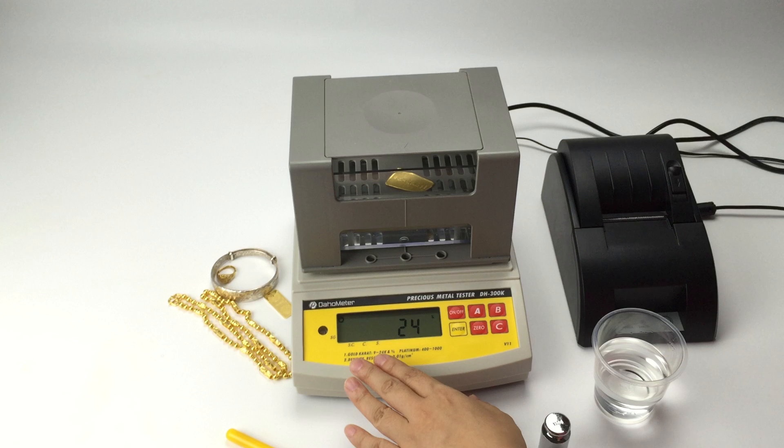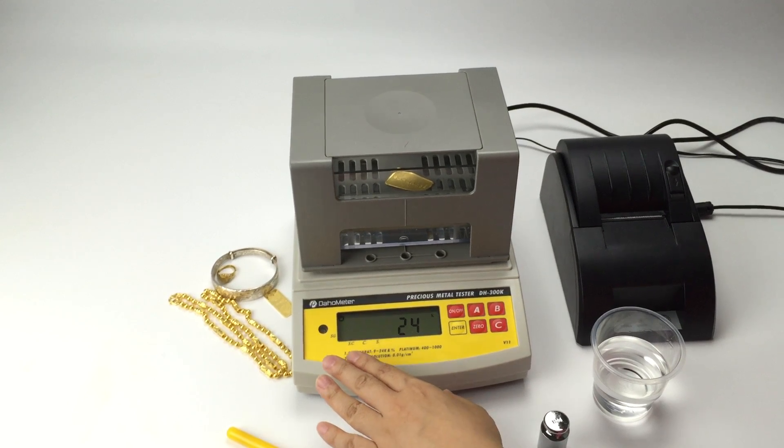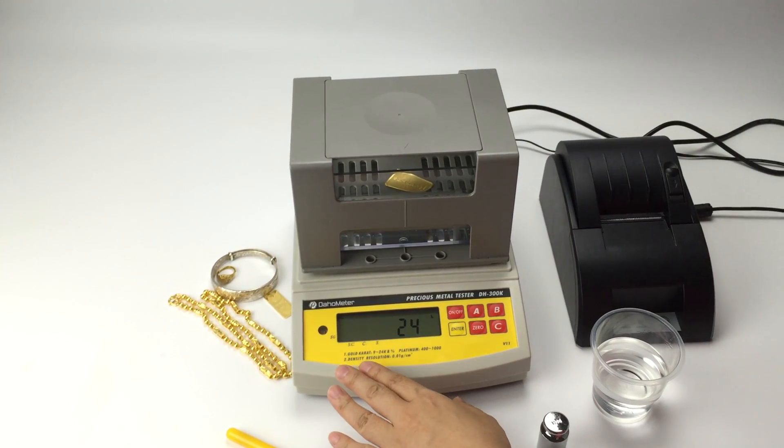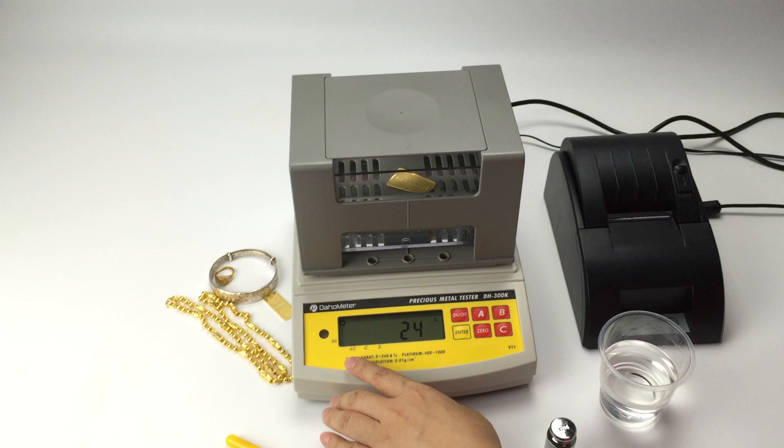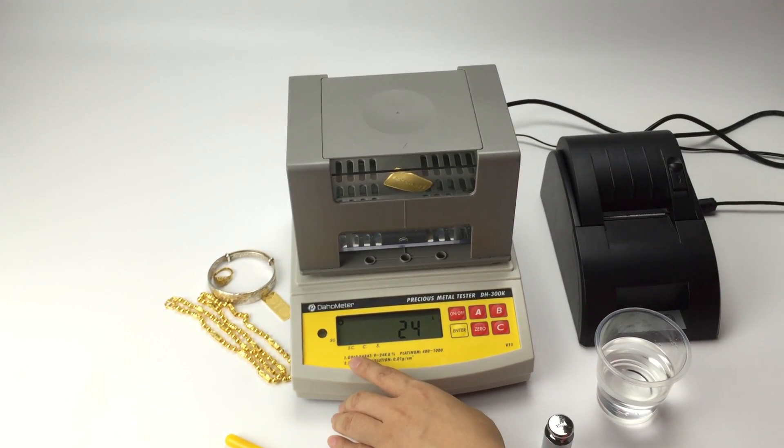24. This is the K value for gold, copper, silver. Also you can see there is arrow directed to SC.